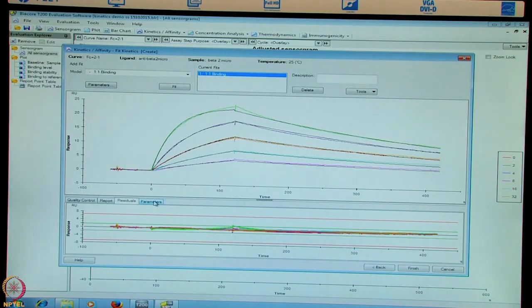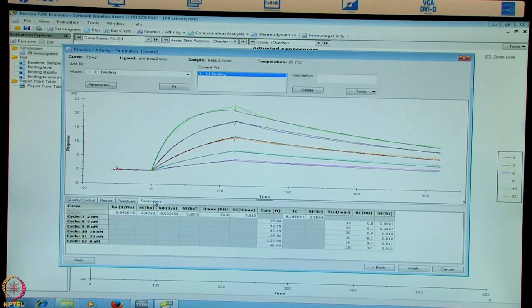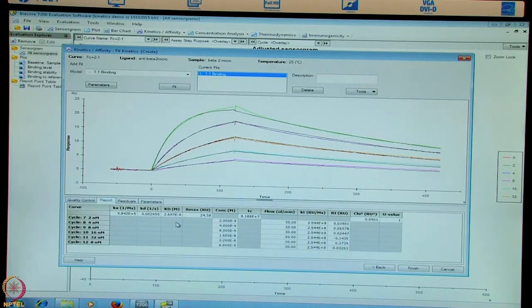Now we go on to another tab, parameters, and find a lot of information which are nothing but the standard errors calculated for the data. With this we conclude the interaction of anti-beta-2M to beta-2 microglobulin at 2.6 nanomolar affinity.